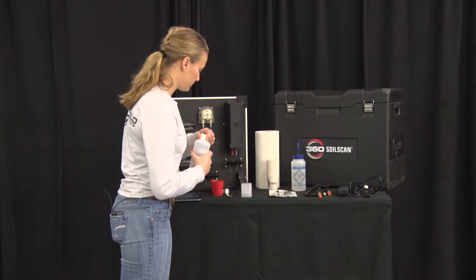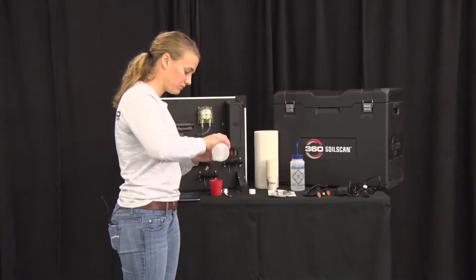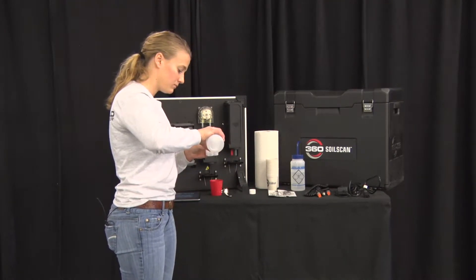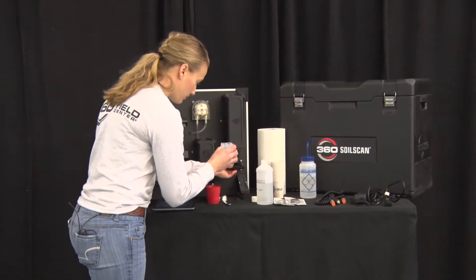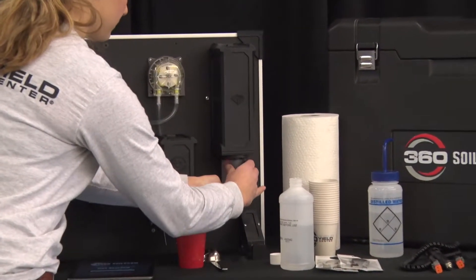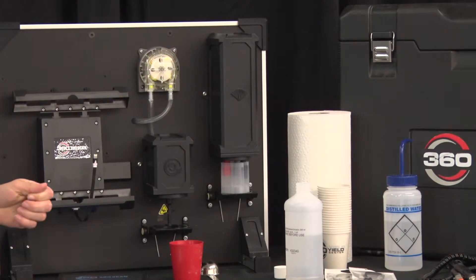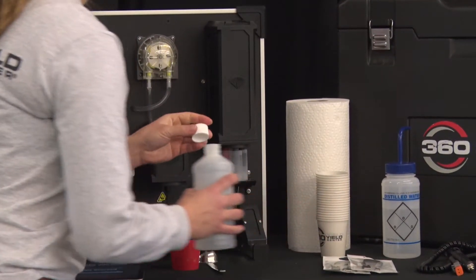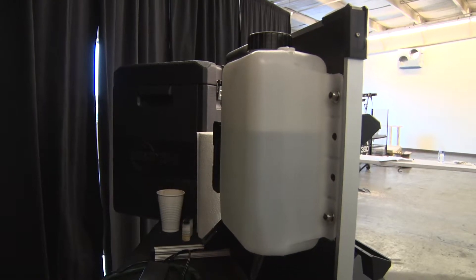Next, use a calibration cup and fill it with nitrate solution. Ensure that you shake the nitrate solution before putting it in the cup. Place the calibration cup underneath the sensors — the sensors will need to soak at least 15 to 20 minutes; if they're having trouble calibrating, let them soak up to 24 hours. Before starting for the day, ensure that you have enough distilled water in the tank to last you throughout the day.